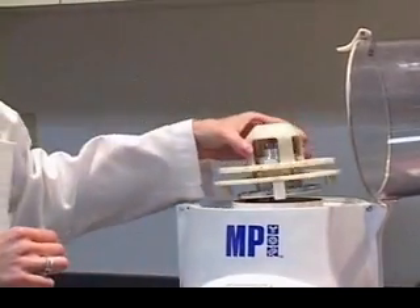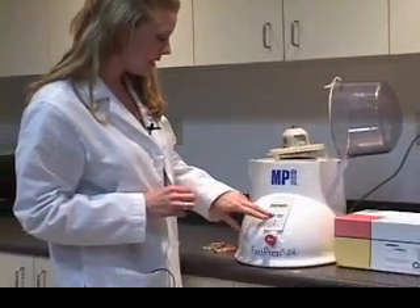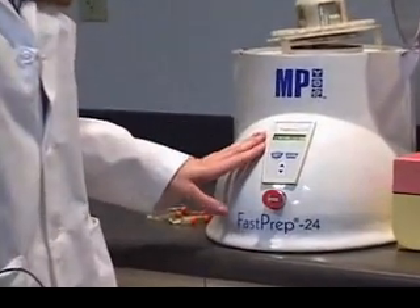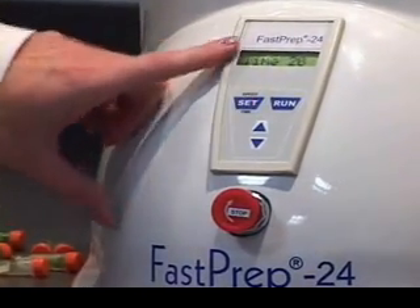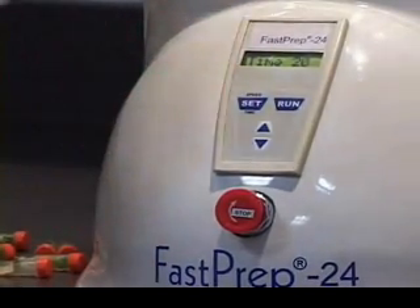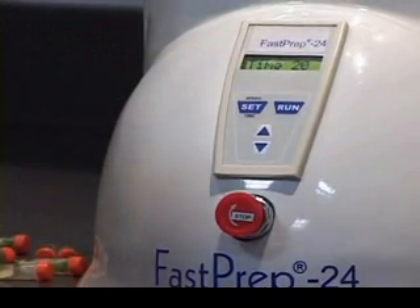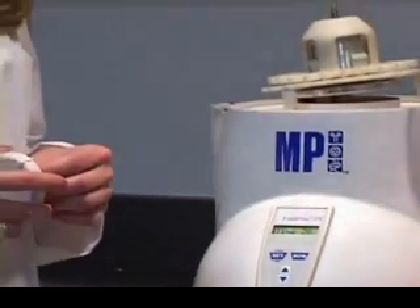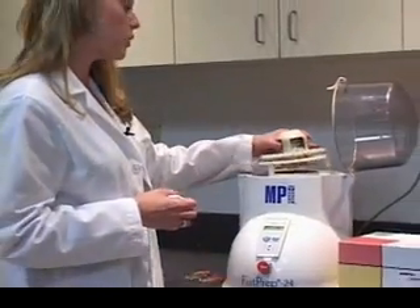The machine typically runs on two different settings. You have either 4 meters per second, going all the way up to 6 meters per second, and then you set a time anywhere between 20 seconds and 60 seconds. Most samples are completely lysed within 20 seconds, but you can choose to lyse them more — definitely up to 40 seconds — and this instrument is much quieter.